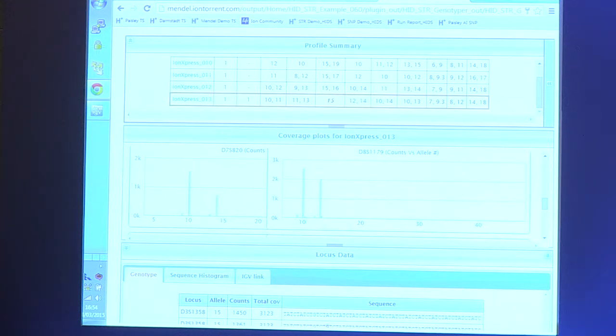And then across the bottom here, you have the size of your allele, as in the number of repeat units inside it. And so these views will look very similar to those that you'll see in a CE run. You can even see little bits of stutter here on the left-hand side of the taller peaks. And then if you hover your mouse over a bar, you can see that this one here represents the 10 allele, and this one here the 14.